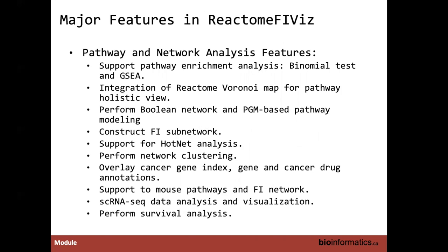many features integrated into it. And I do apologize, but I simply don't have time to talk about all of them today and to demonstrate some of those features. But I think the most important features are listed here: support for pathway enrichment analysis and GSEA, the integration of a variety of different summary views, such as these Voronoi tessellations to give a holistic view of pathways. We've integrated a variety of different modeling, whether that's Boolean network or PGM-based pathway modeling systems.